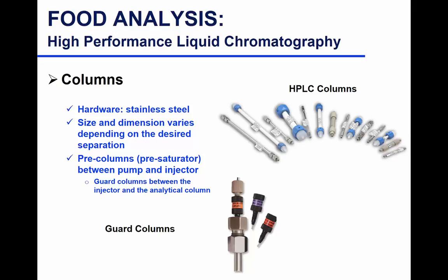Guard columns are reusable, first of all. You can reuse them multiple times, and then you have to change them often. Sometimes you see an increase in pressure in your system, and that could be due to a plugged guard column. That means it's time to change the guard column.